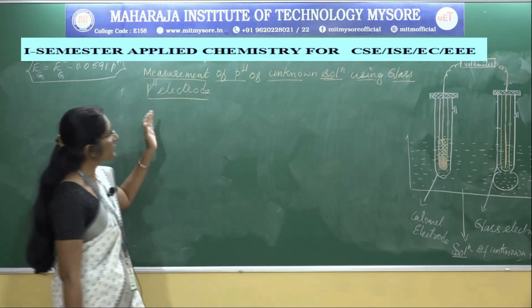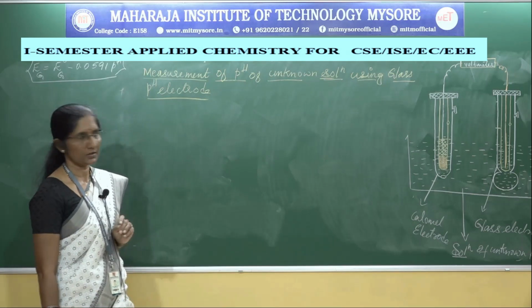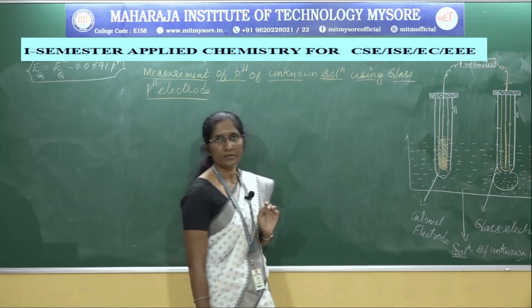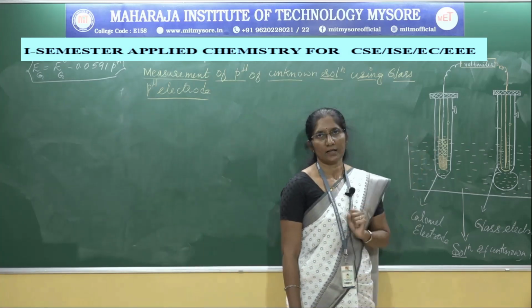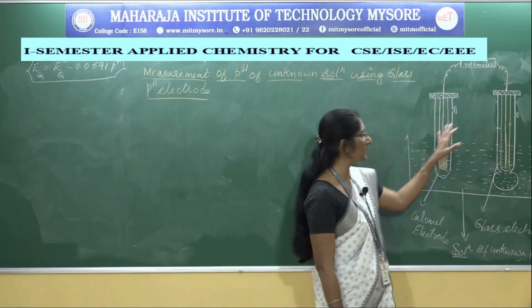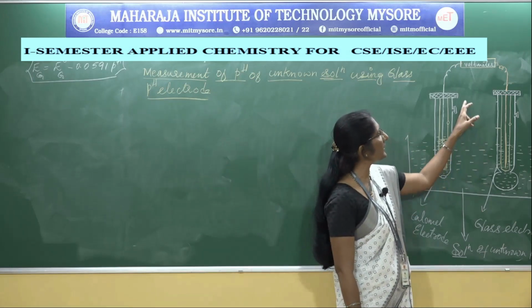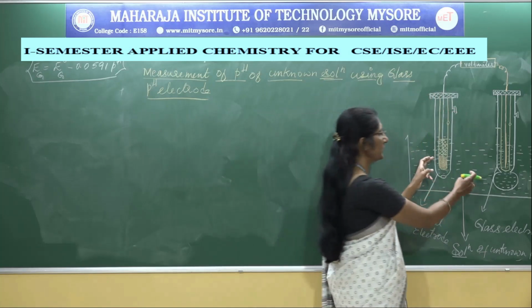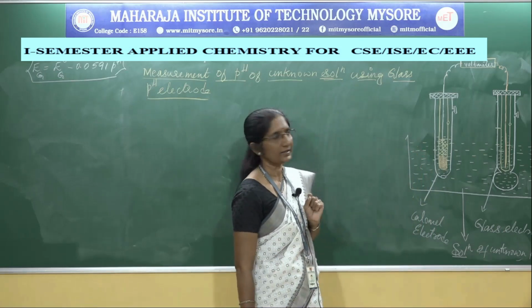Next one is measurement of pH of unknown solution using glass pH electrode. To measure the pH of a given or unknown solution, first we have to construct the galvanic cell. How to construct the galvanic cell? The glass electrode should be coupled with a saturated calomel electrode. Then these two are connected by a highly sensitive voltmeter. By joining these two electrodes with the voltmeter, we get a galvanic cell.